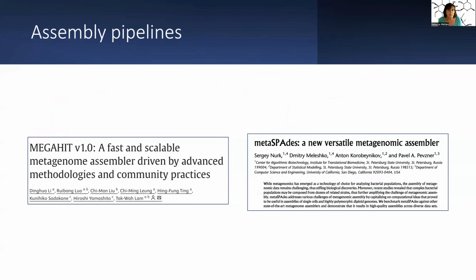So going in a little more deeply, there are two different assembly algorithms that can be used in this service, MEGAHIT or metaSPAdes, and you can just leave it at auto and let it decide. Another thing that you can do that I've had some luck with, especially when I'm looking at a hybrid assembly, I go to the assembly pipeline and assemble the genomes there, with long and short reads for the hybrid part. I'd use Canu or Flye or Unicycler to do that and then submit the contigs here.